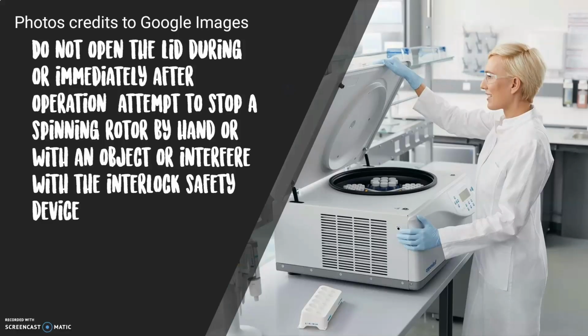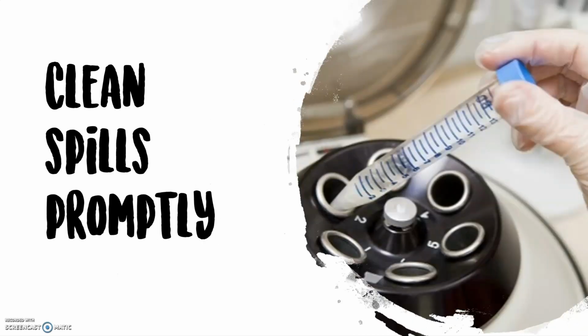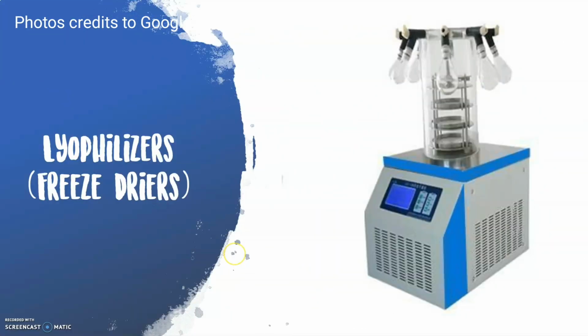Do not open the lid during or immediately after operation. Do not attempt to stop a spinning rotor by hand or with an object, or interfere with the interlock safety device. Decant supernatants carefully and avoid vigorous shaking when resuspending packed cells. Of course, clean spills promptly.